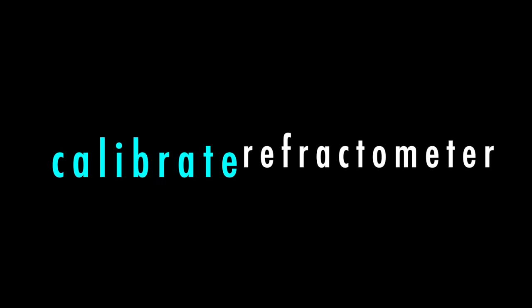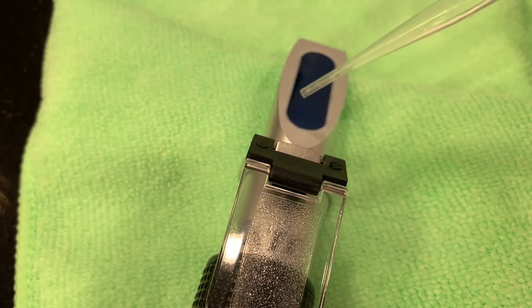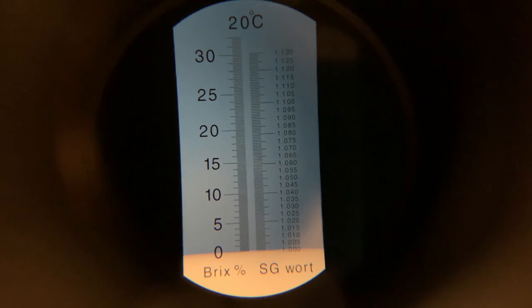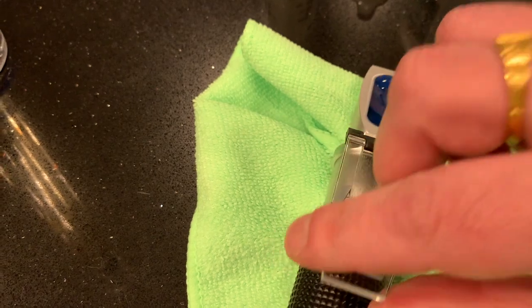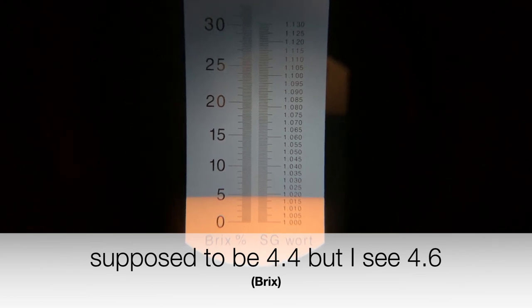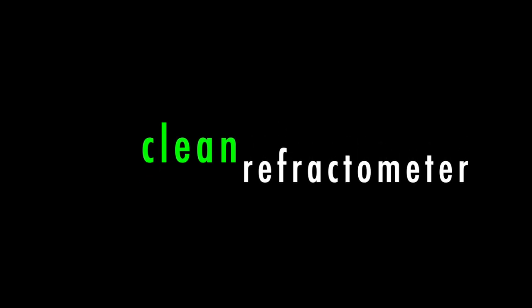Now let's calibrate the refractometer. First, with some distilled water on the glass plate, close it up and wait 30 seconds, then look through the viewfinder — it's at zero, that's good. I also have a calibration solution; it's supposed to be 4.4 but I actually see 4.6 here, so this seems to be reading a bit high. It's also important to clean the refractometer after each use — rinse it and dry it thoroughly.